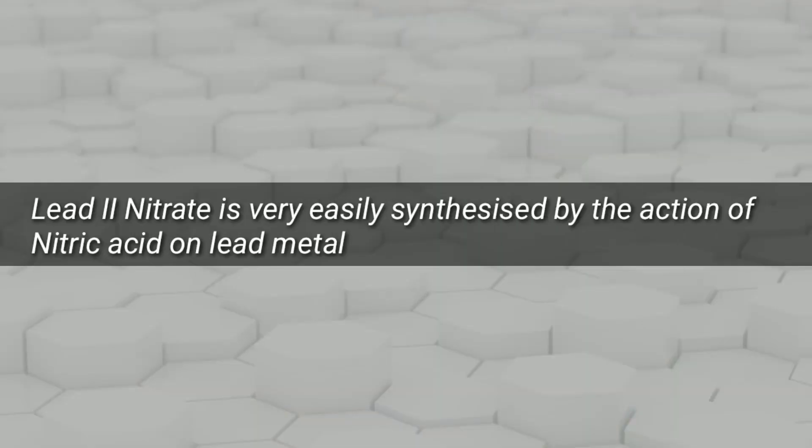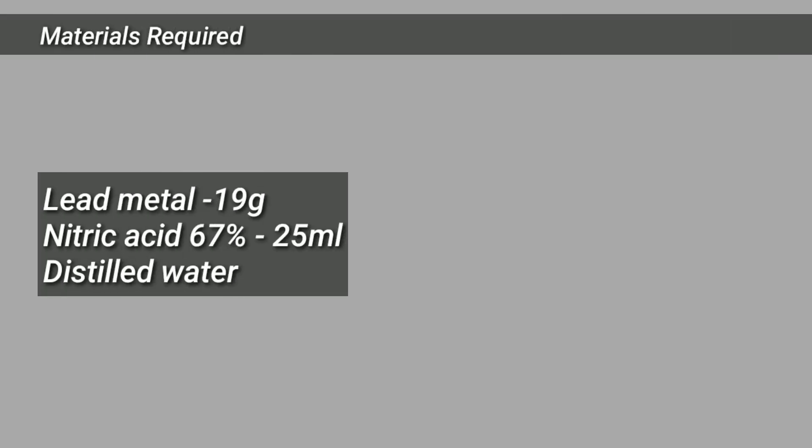Lead(II) nitrate is very easily synthesized by the action of nitric acid on lead metal, especially dilute nitric acid. We will not be going according to the exact stoichiometry, as we need a little excess of nitric acid to prevent the formation of basic lead nitrate.